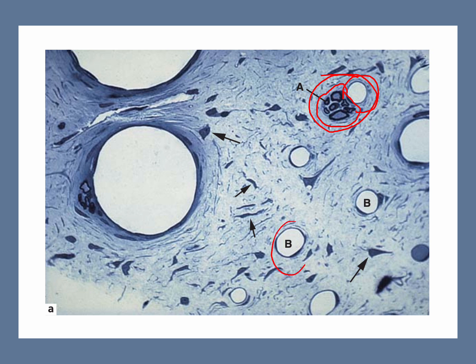Of course, the other ones are capillaries, and after the branching, they are no longer associated with nerves. This one is an arteriole. It has smooth muscles around it. The other ones are venules. And you can take a look here at the fibroblasts. They look stellate, big, with a lot of processes around them.